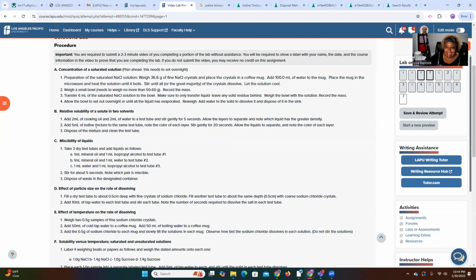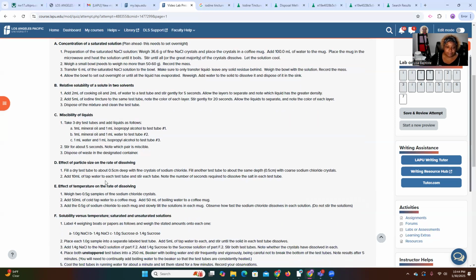They're not safe for the environment if they do. And so you want to pour these into the trash, and make sure you have some paper towels to absorb these liquids when you're dumping them. So for everything for part B, for everything for part C, we are dumping into the trash, because none of these substances need to go down the drain. So be careful of that.